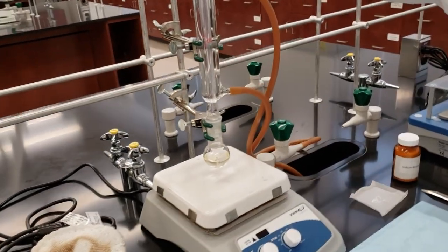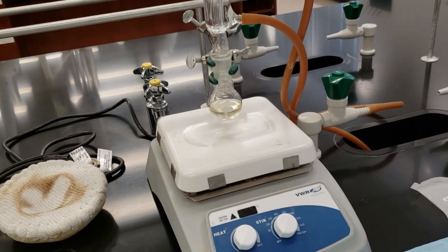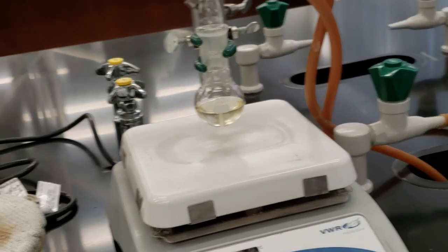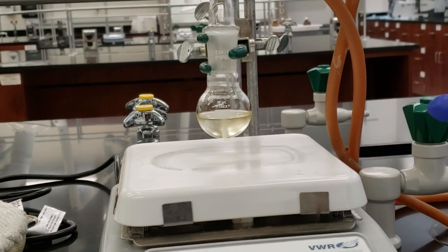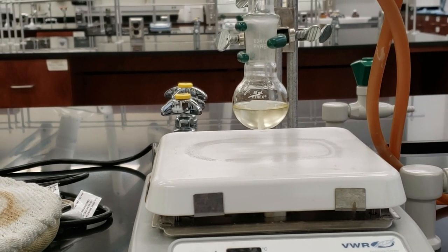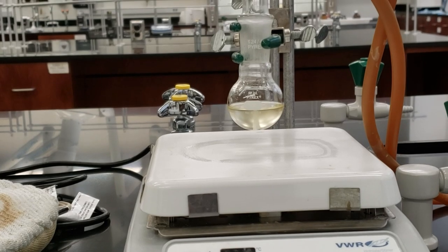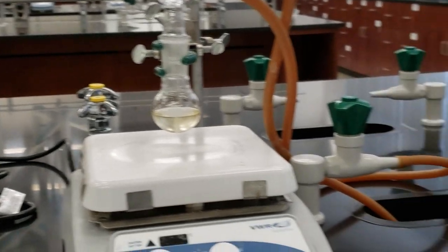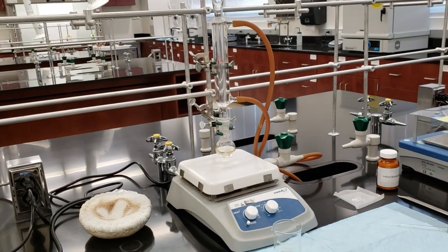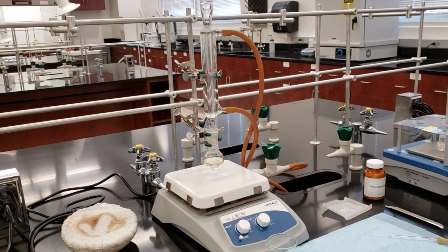We've allowed our solution to stir for 5 minutes, then we let it stand for 5 minutes so that the layers will separate. We can see, if we get down to the level of the flask, a slight yellow layer on top, and that's our alkyl halide product layer. So what we're going to do now is take our reflux condenser off. I'm going to use a pipette to take away our lower aqueous layer as much as I can in the flask. And then once we get down to a couple of milliliters, I'll transfer it into a conical vial.